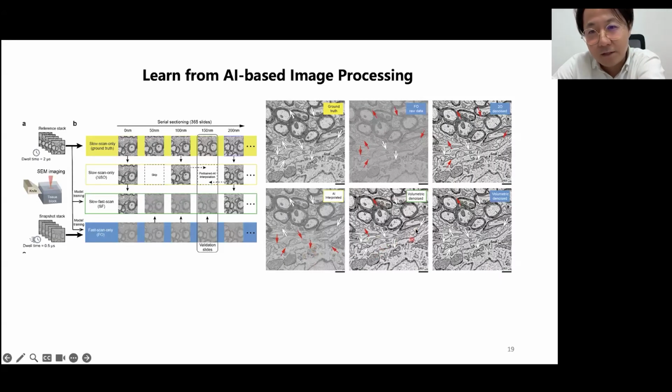And in our case, the 3D denoising, we call it volumetric denoising, to distinguish it from temporal serial denoising, which others call 3D denoising. Of course, you will have some artifacts. It's not perfect, but in principle, we can preserve more detail based on the ground truth.